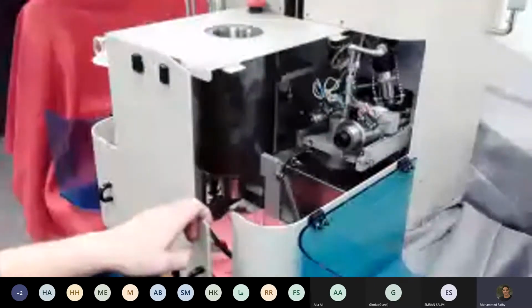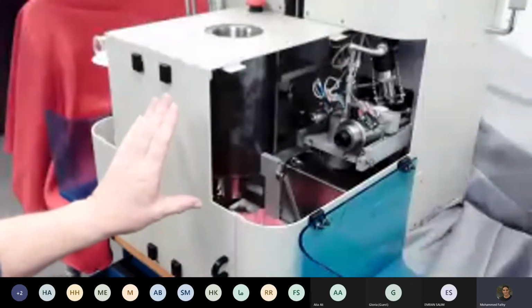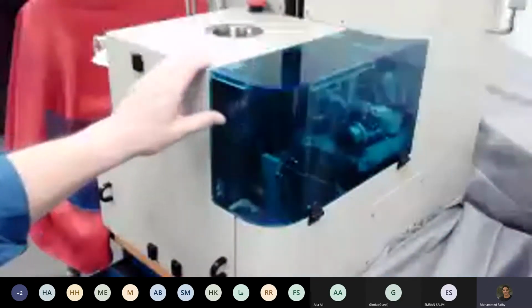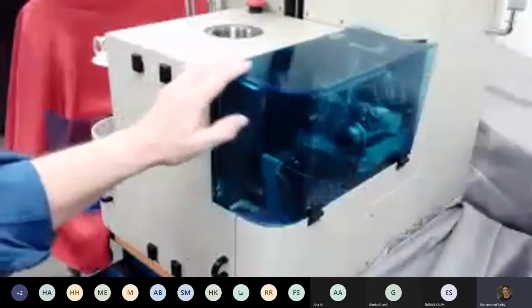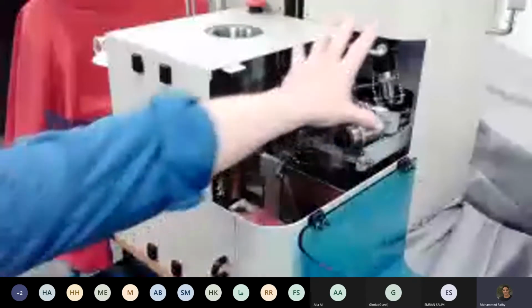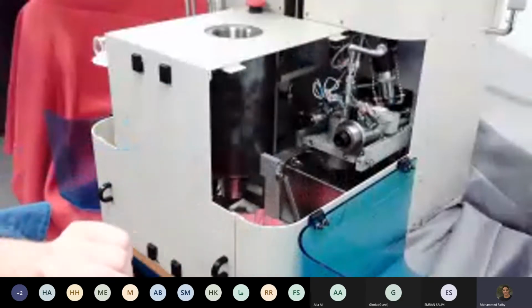So this is the front door behind which the mercury reservoir sits, and so when you're filling mercury, it's only this door that needs to be open, so it contains the vapors really, really well. When you're working with the low pressure stations, this flap would be down, but I have had a cover removed here so we can see some of the safety features here.